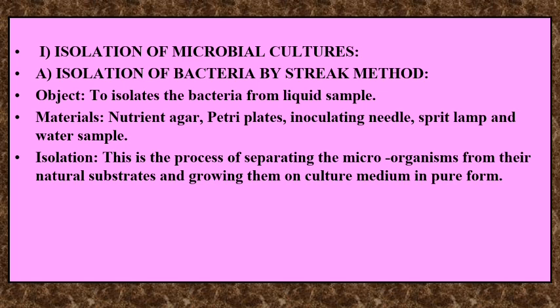Isolation. So what is meant by isolation? This is the definition of isolation: the process of separating the microorganism from its natural substrate and growing it on culture medium in pure form.